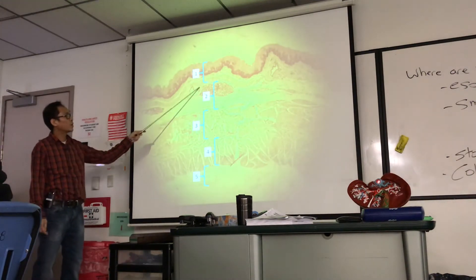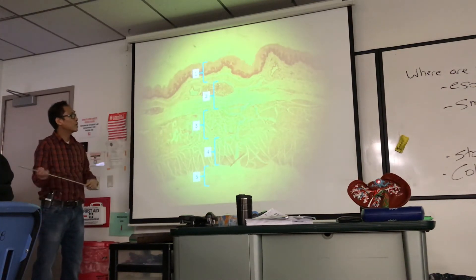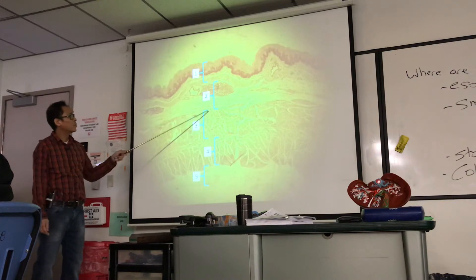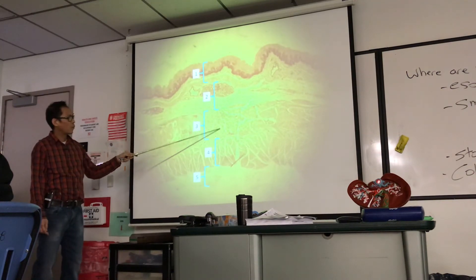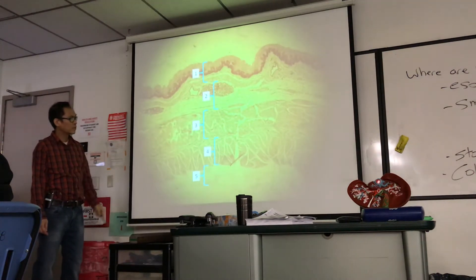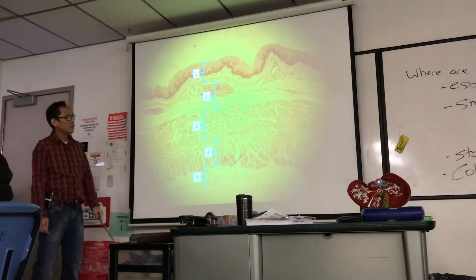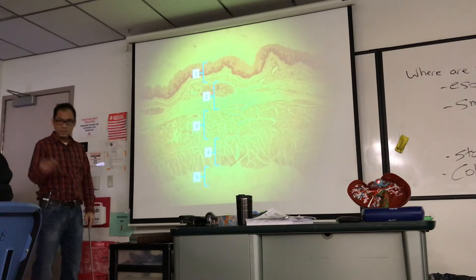Number one, from here to here: mucosa. Number two: submucosa. Number three: circular layer of muscularis externa. Number four: the longitudinal layer of muscularis externa. Number five: serosa/adventitia.